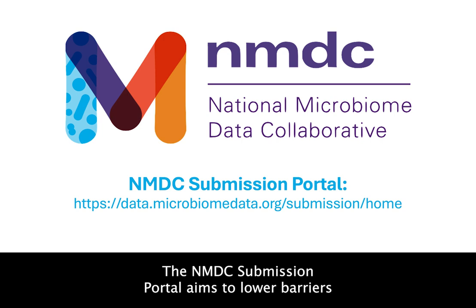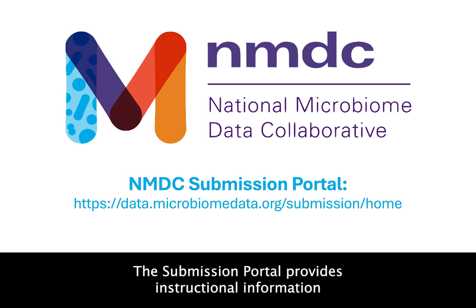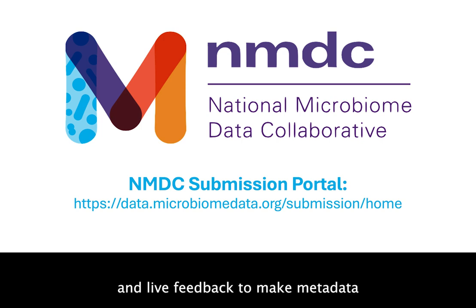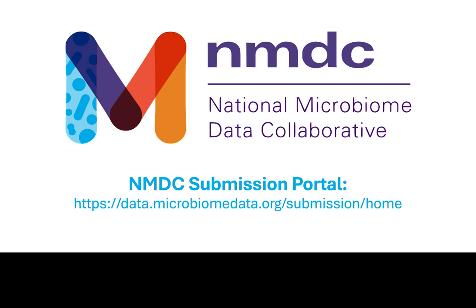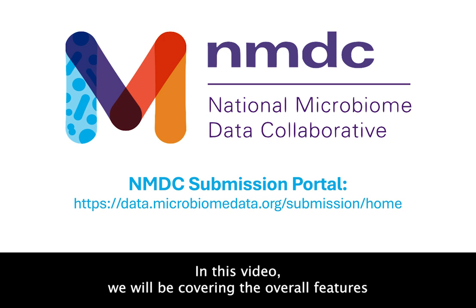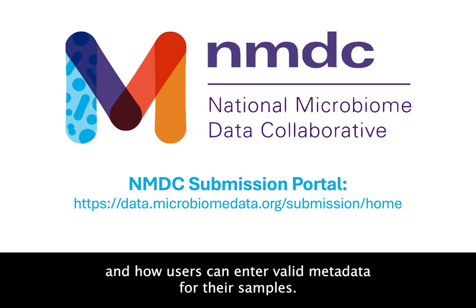The NMDC Submission Portal aims to lower barriers to effective metadata collection for microbiome data. The Submission Portal provides instructional information and live feedback to make metadata standard templates understandable and accessible. In this video, we will be covering the overall features and functions of the NMDC Submission Portal and how users can enter valid metadata for their samples.